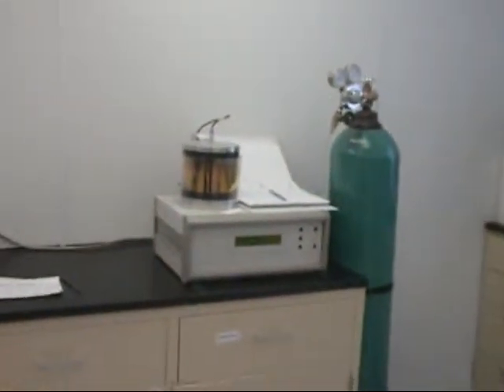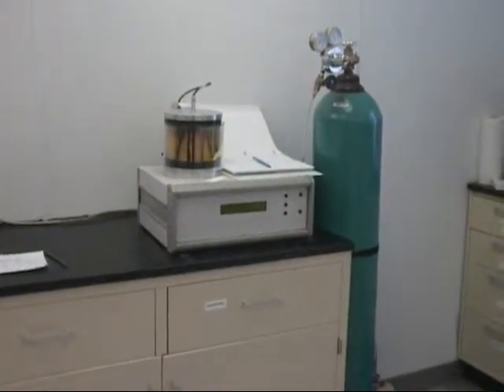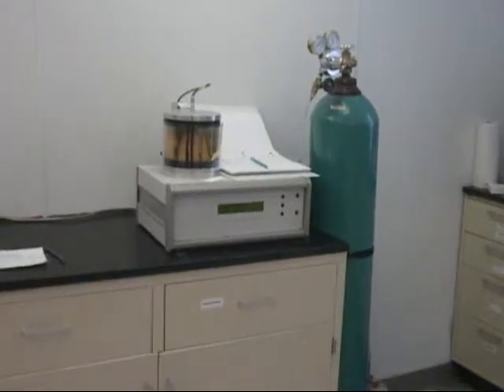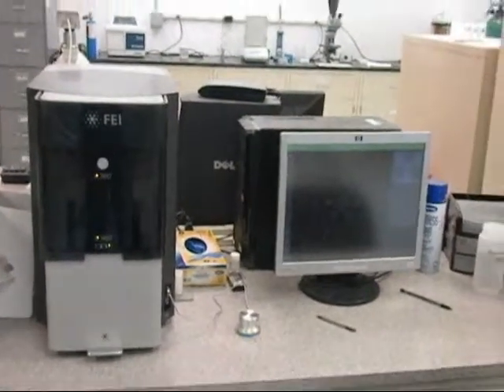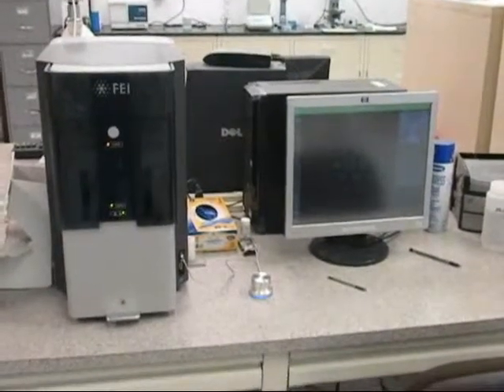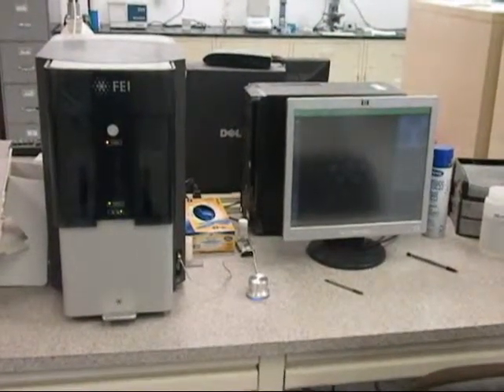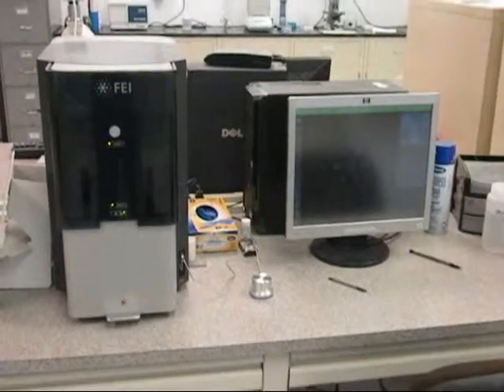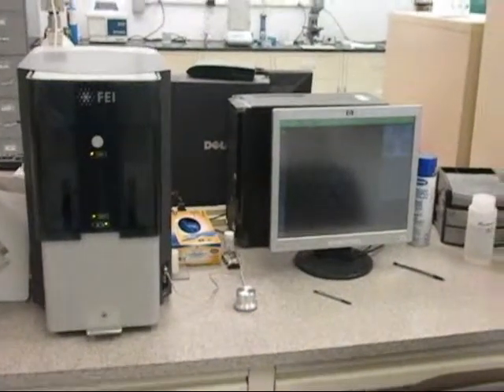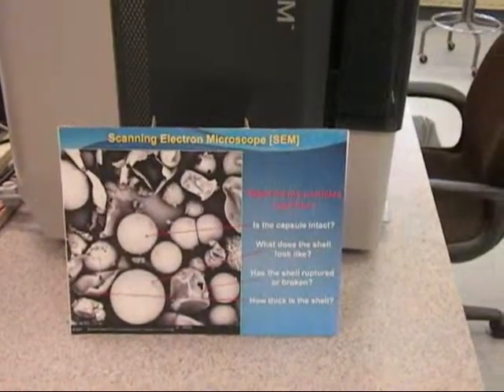Right over here is a sputter coater, and the sputter coater is used for sputtering gold particles onto things such as organics. The reason for using this will show in this next slide here. The sputter coater is actually used to prepare samples. They're subsequently going to be going in for analysis using the Phenom SEM. This is a benchtop SEM we have, and this is probably a quarter of the size and a quarter of the price of most conventional SEMs. This machine can get very beautiful 3D pictures. In fact, here's a little example of some of the particles and pictures that we were able to obtain with this instrument.